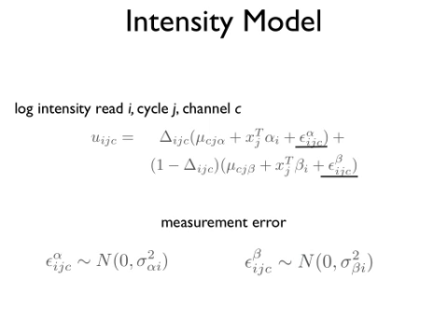Now, the other thing that comes from this is for the statisticians in the room. Once you pose a model like this, you can estimate the correct base call by fitting this model. What are you trying to estimate then? If you are trying to do base calling, let's see if you can read a statistical model. In that formula, the actual correct calls are up there. Which ones are they?